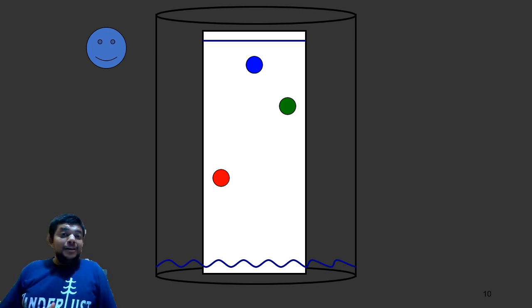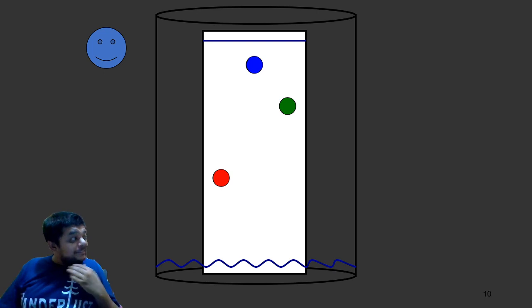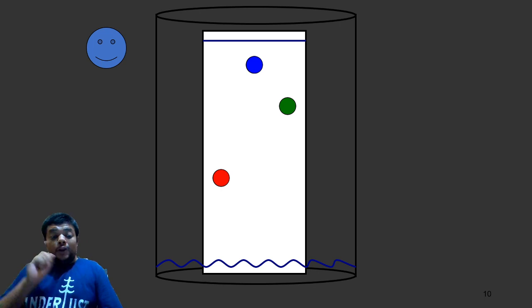कभी ऐसा सुना है नाव आगे चलेगी और पानी पीछे पीछे आ रहा है? The boat has run away and the water is coming behind. Not possible. Why? Because that water is a carrier for that boat. Similarly, the mobile phase over here is a carrier for these samples. So always the distance traveled by the mobile phase will be more compared to the distance traveled by the samples.